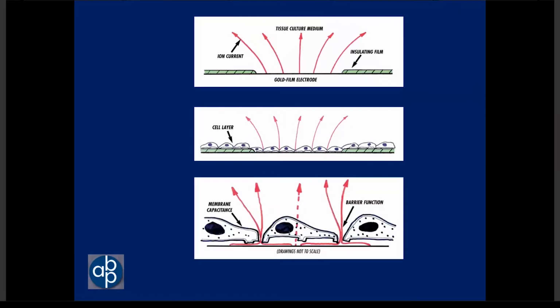The solid line is showing that the current, carried by ions again, can simply flow beneath the cell around the adhesion plaques and through the paracellular space between the adjacent cells. But notice there's the dotted line that goes right through the cells. And this is to indicate that some current will couple capacitively through the cell membranes, much as in 2 metal plates in Physics 1, thinking about a capacitor, an AC signal effectively can pass through the capacitor by charging and discharging the different metal plates.